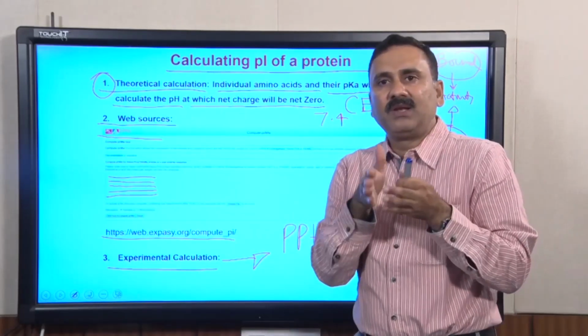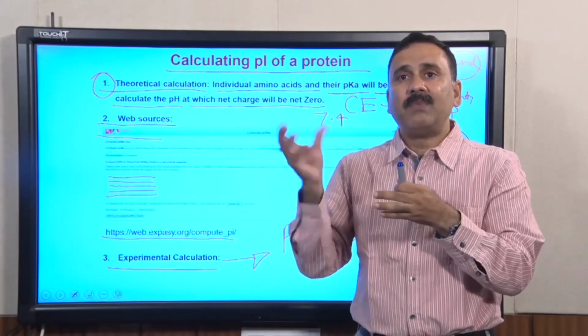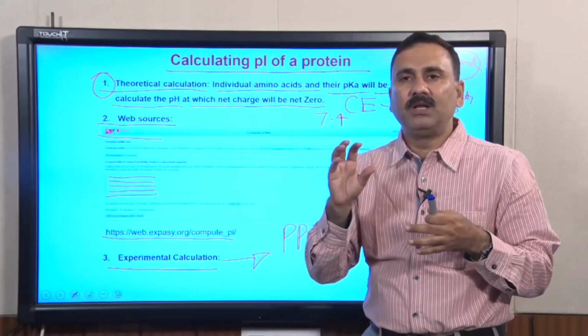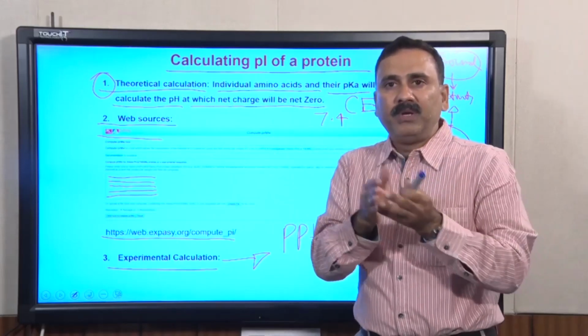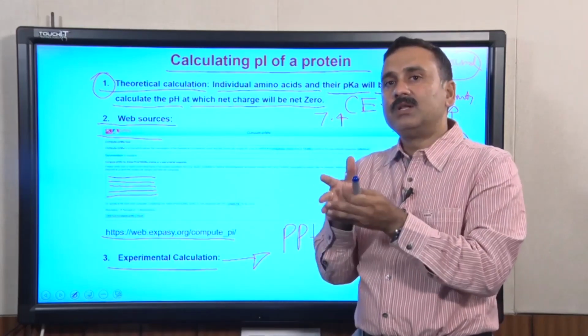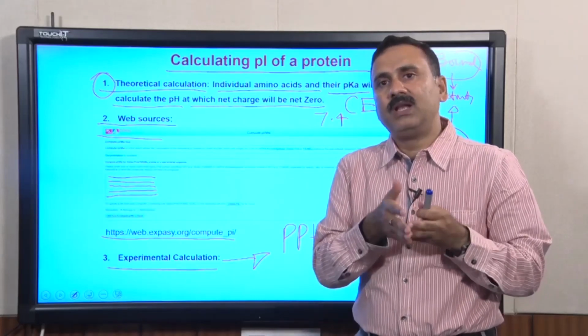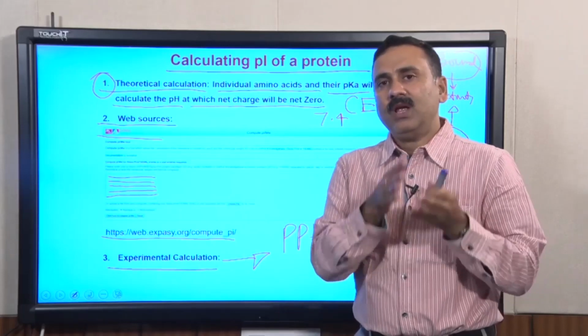As soon as the protein starts coming out of the solution, it forms particles, which means it is not soluble, and that is how it gives more and more scattering. The pH at which the scattering is highest is the pI value, and that is how you can calculate the pI value very precisely.